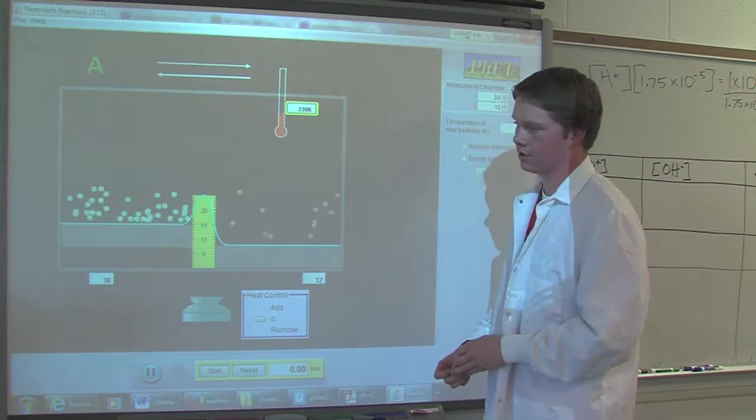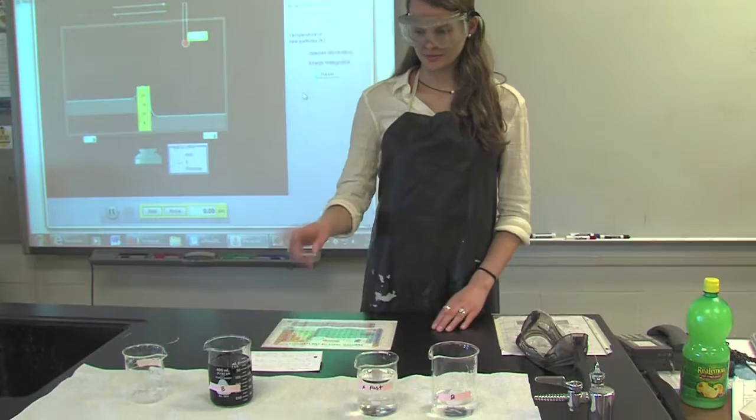Here in beaker A we have four times as much potassium iodate as we had in the original reaction, which should speed up the reaction.